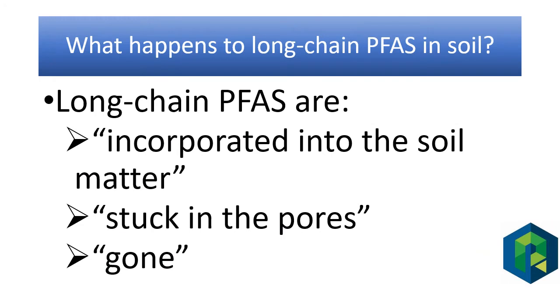Well, I've heard it said that long-chain PFAS are incorporated into the soil matter. In other words, they become part of the soil. I've also heard it said that they're stuck in the pores, or simply that the long-chain PFAS are gone, and these would explain the low yields that we see. But this is an interesting situation as an analytical chemist, because there are ways of testing how well we can extract long-chain PFAS from soil.